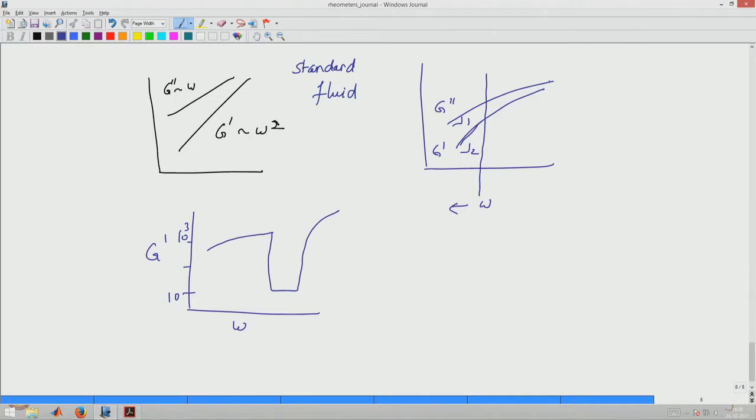Now the question in such data is, at this frequency is something happening to my sample, some structure which collapses, and then again it comes back up. What is the reason for these kinds of things? This is the real analysis that one has to do if we are doing experiments with unknown samples. Is this real for my sample? Is this an instrument artifact?